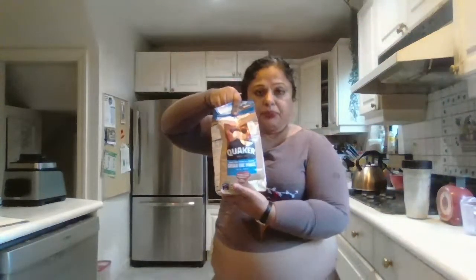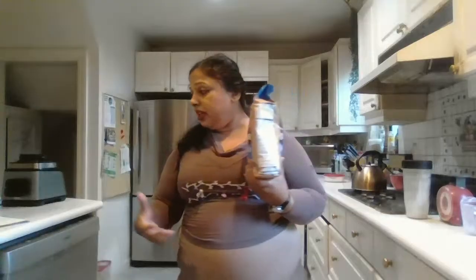And I have, as a measure, Quaker oats, which have the protein content on the packaging label. 40 grams of Quaker oats have 5 grams of protein. So that's 1/8, and I'm going to do the calibration curve for this protein.